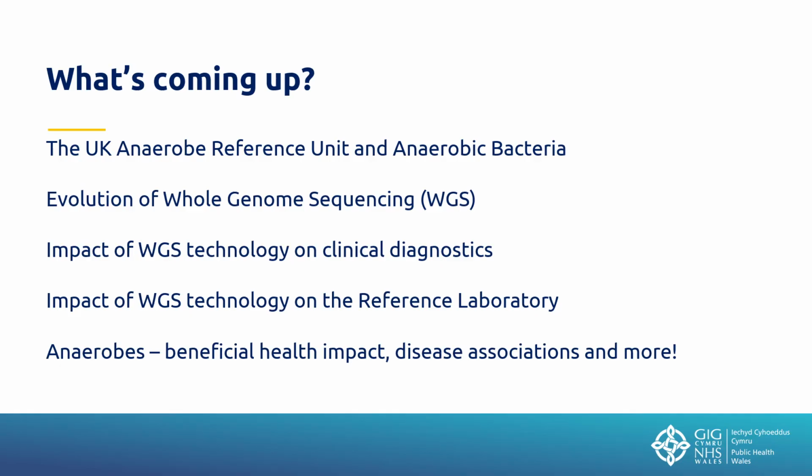So what's coming up? I'm going to remind you about anaerobic bacteria and give you a brief summary of what we do at the UK Anaerobe Reference Unit. We'll go through the evolution of whole genome sequencing, where it started and where we are now. We'll talk about the impact of WGS on clinical diagnostics, and then I'll go through the impact that we're seeing within our own reference laboratory, which will be applicable to other reference laboratories as well, I'm sure.